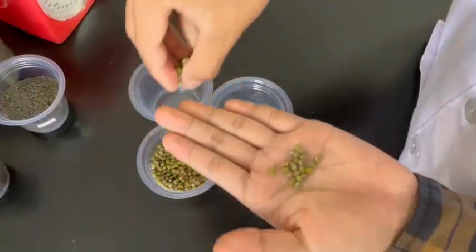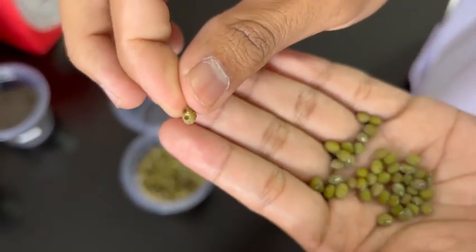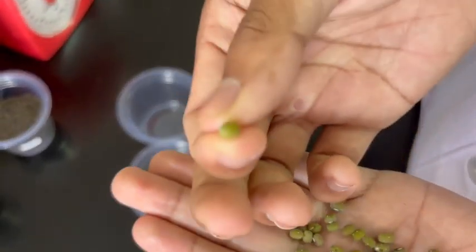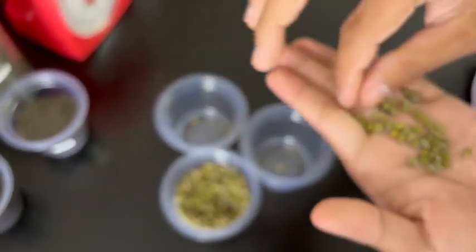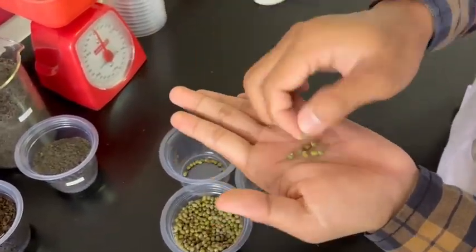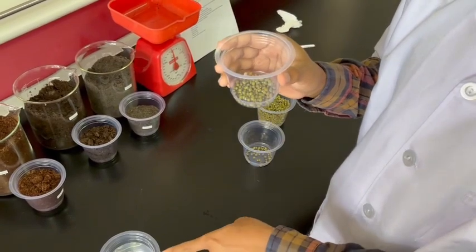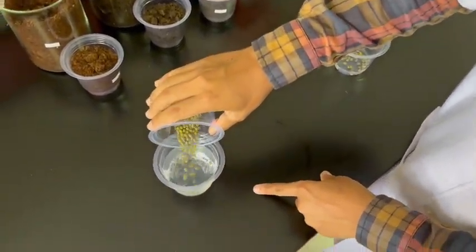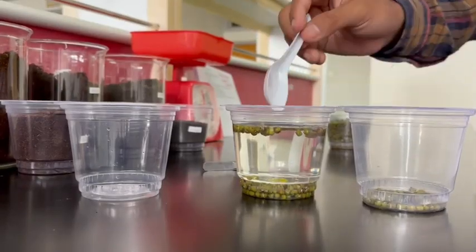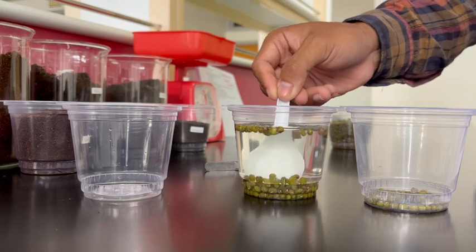First, put the bad quality of the seed that looks like this here, and the good quality like this here. To make sure whether this is viable or not, soak this in the water. Okay, select the non-viable seed here and the viable seed here. And the viable seed is submerged.